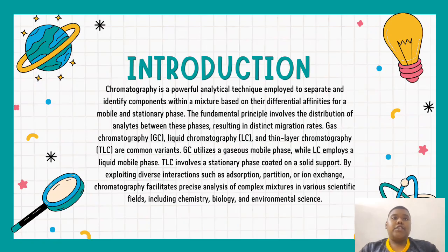So, introduction. Chromatography is a powerful analytical technique employed to separate and identify components within a mixture based on their differential affinities for the mobile and stationary phase. The fundamental principle involves the distribution of analytes between these phases, resulting in distinct migration rates. Gas chromatography (GC), liquid chromatography (LC), and thin layer chromatography (TLC) are common variants.